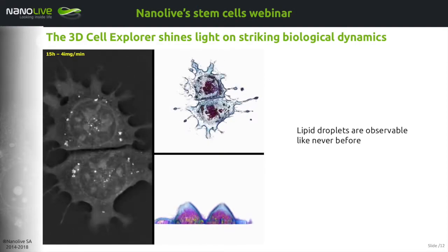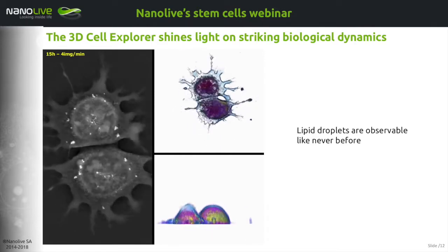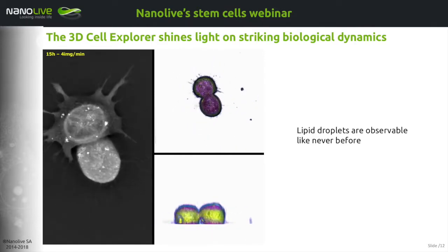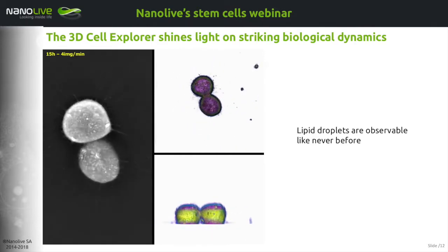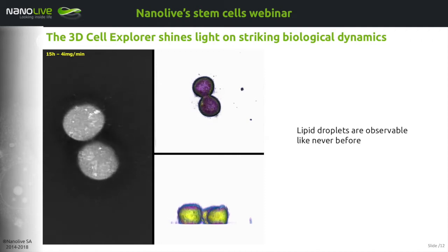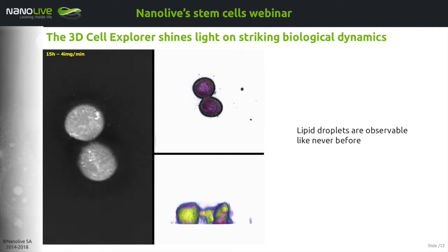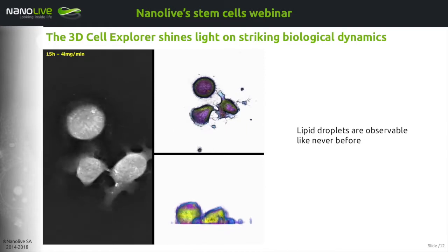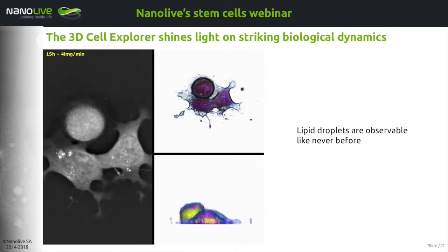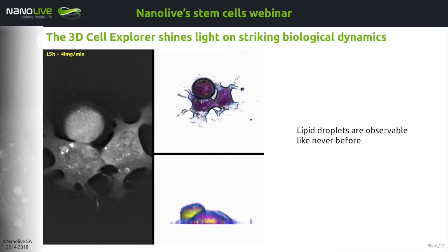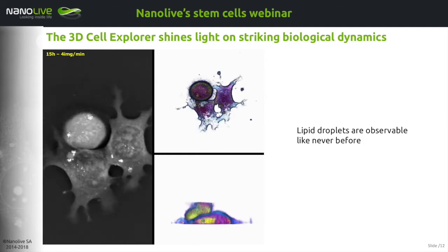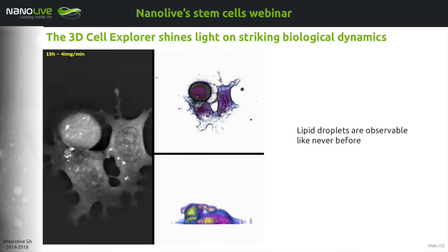Typically, one could — though it hasn't been done yet — observe the effect of specific metabolic drugs on new parameters of lipid droplet dynamics. This is one of the many advantages of being able to follow such lipid droplets with such temporal resolution.